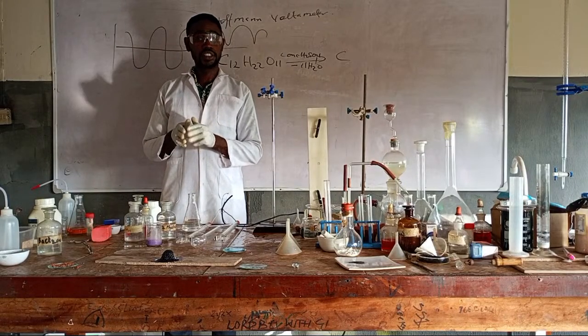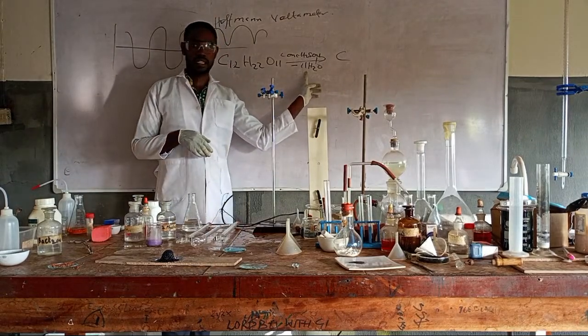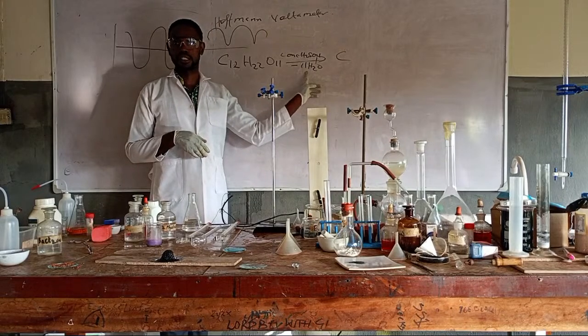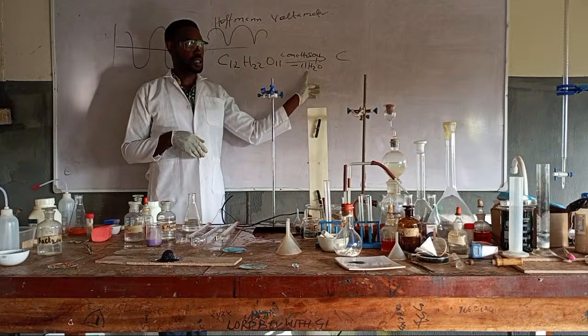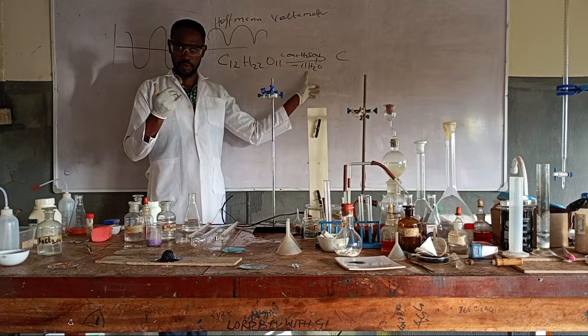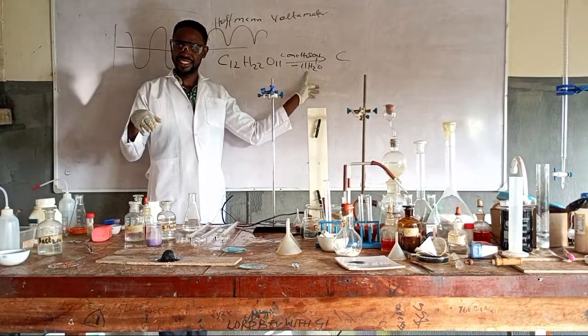So it has turned into charcoal. And I know the question you are asking me. This steam is being turned to gas. It's just like you are roasting something. The smoke coming out. Am I communicating? So, and if you can perceive something now, are you perceiving a drug you do take? Yes.